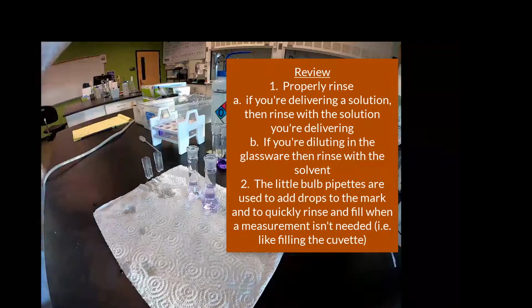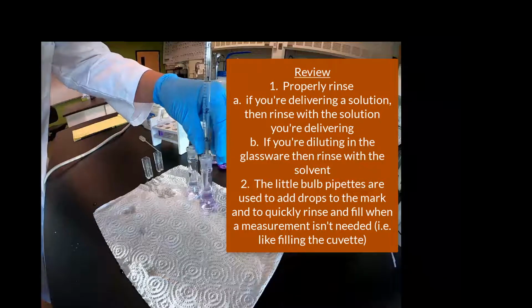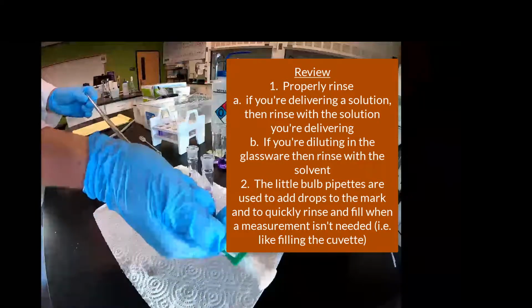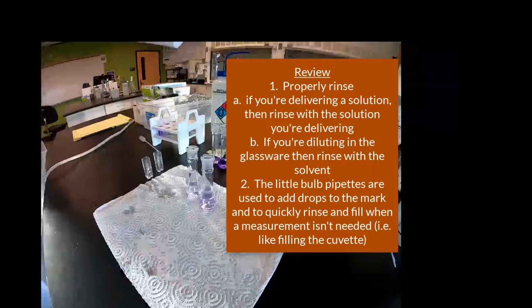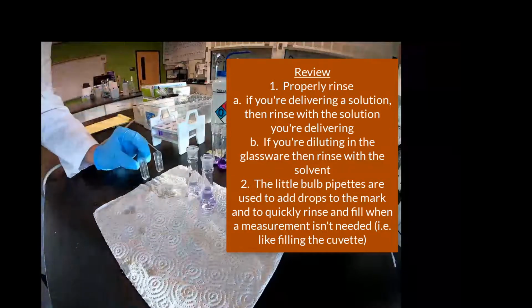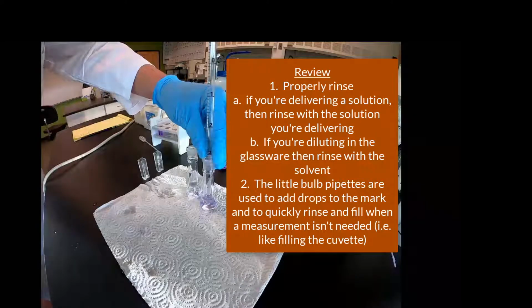All right. So anyway, he's going to load those 2 cuvettes up with sample. Again, you want to rinse out the cuvette before you fill it with the solution. He's rinsing the cuvette and the volumetric pipette. It's good, all in one step. That's kind of a cool technique the way he does that. And now we can actually load the sample. And again, the volume added does not matter. You just got to get past where the window is and fill these 2 flasks.